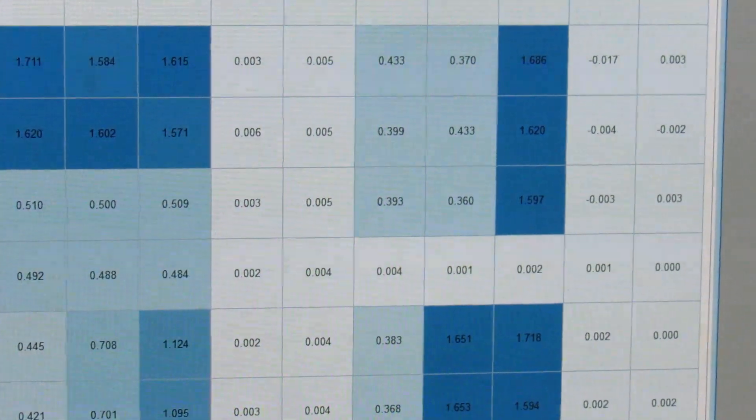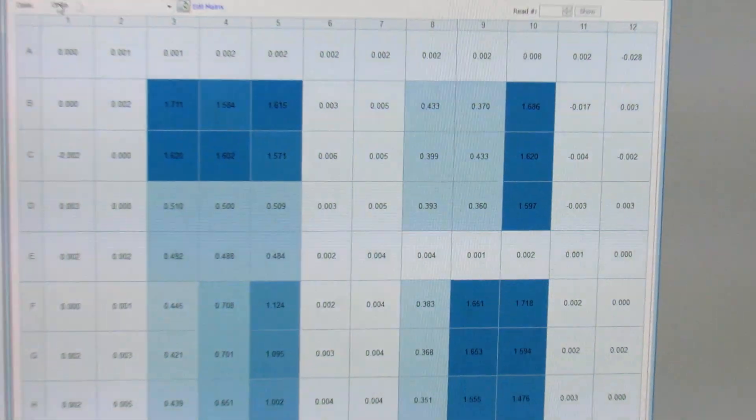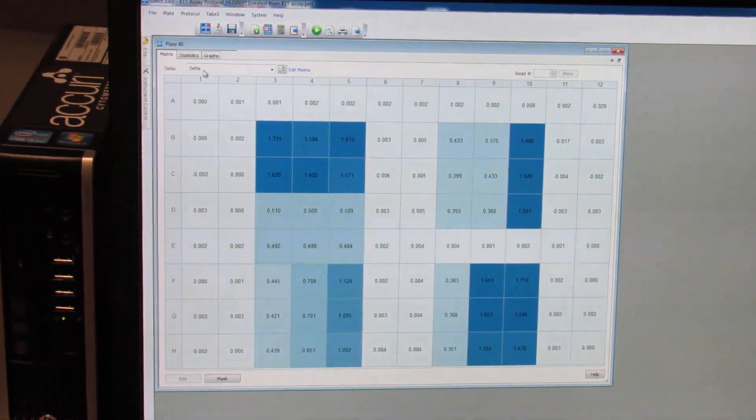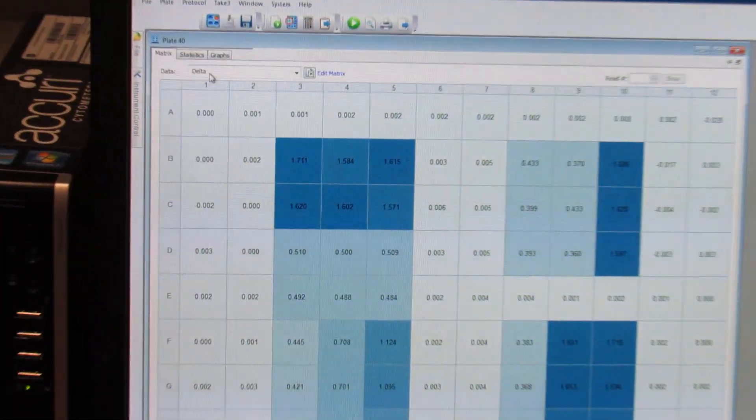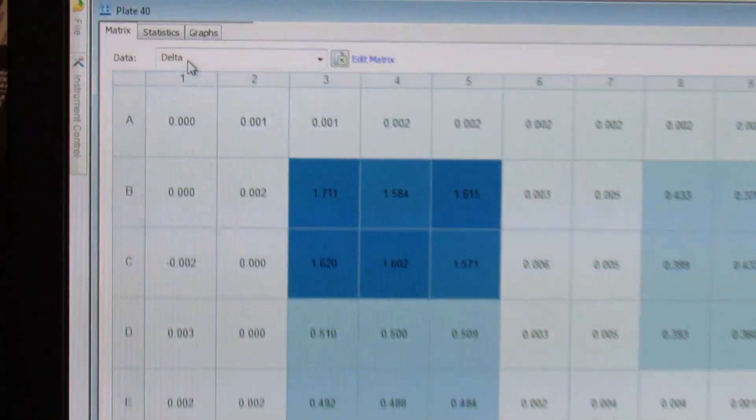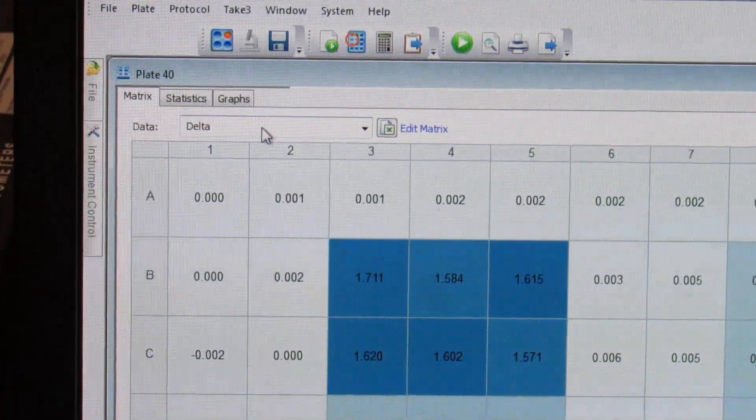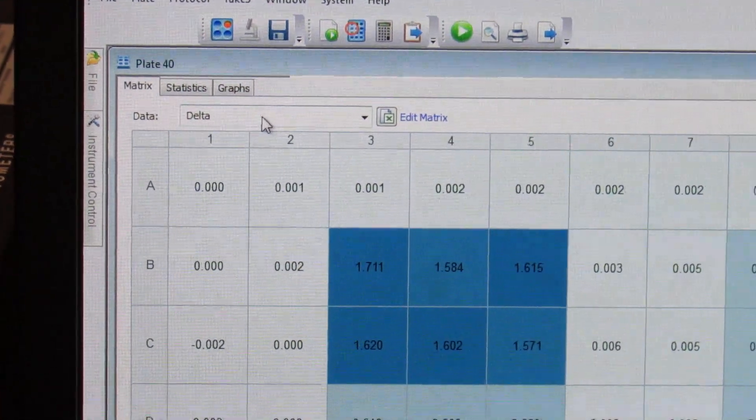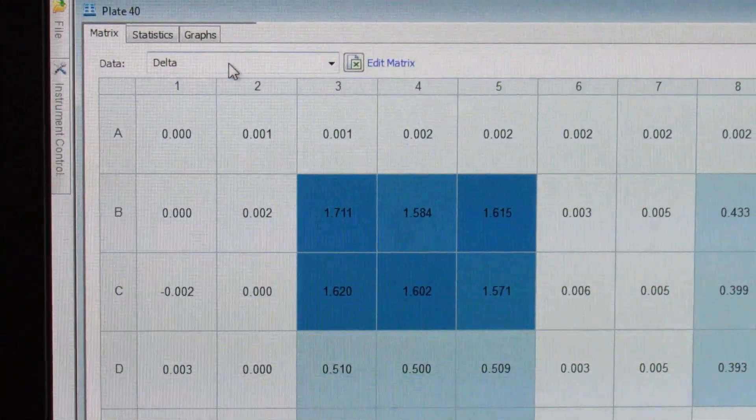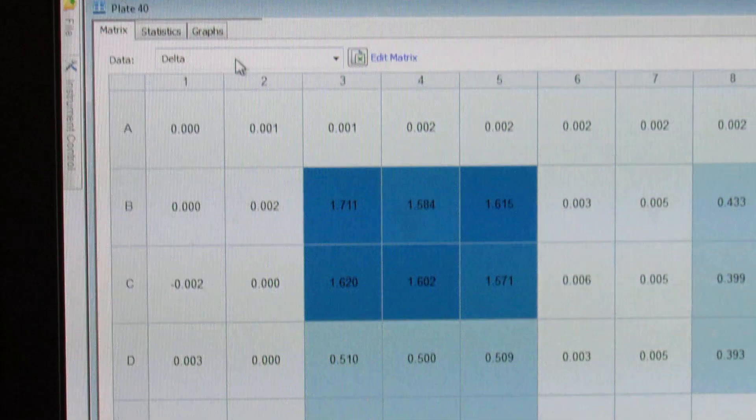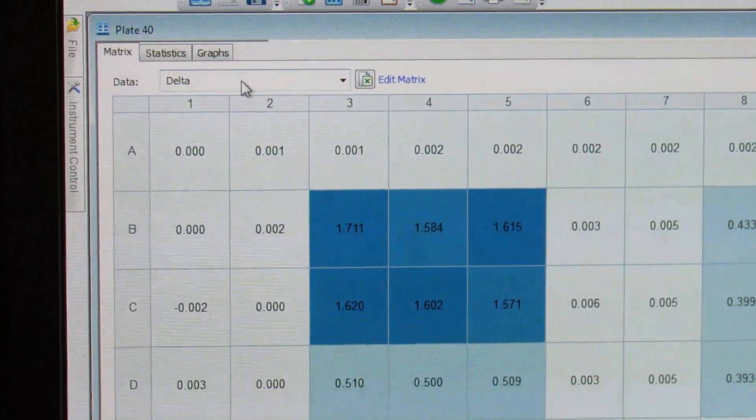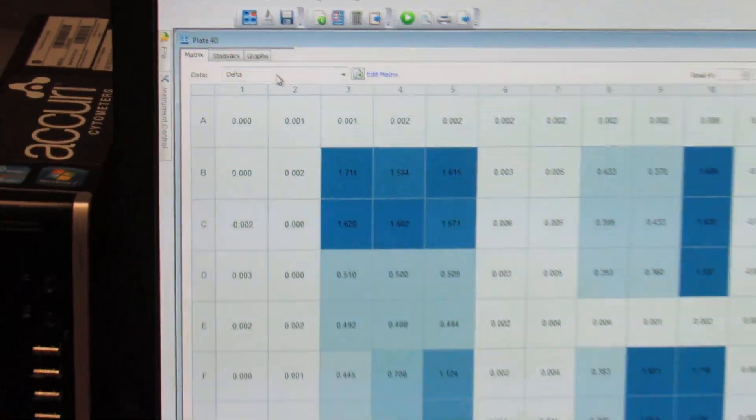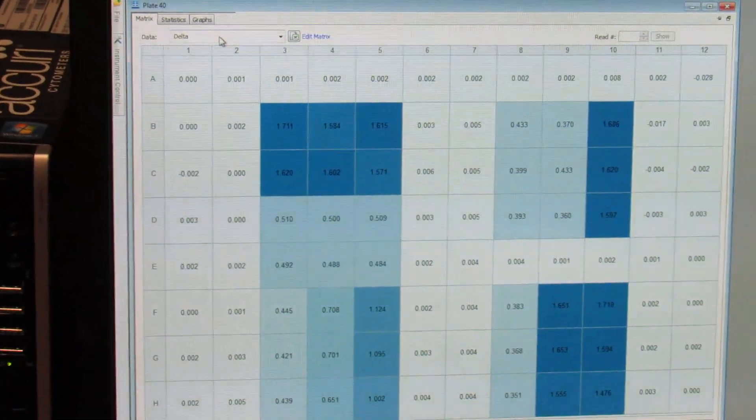You'll hit OK again. And after that, you want to make sure that you're set to read to Delta. What Delta does, it takes the absorbance of the two different values and it subtracts them to avoid all of the background. And those values are going to be important later on whenever you're reading your plate.